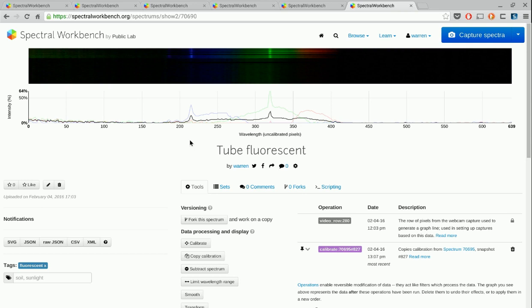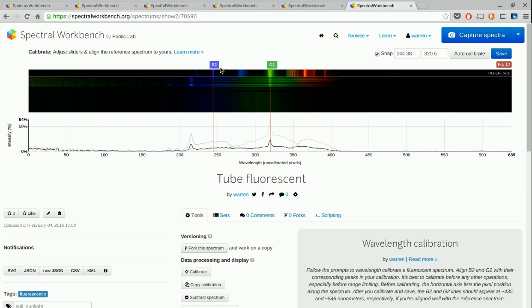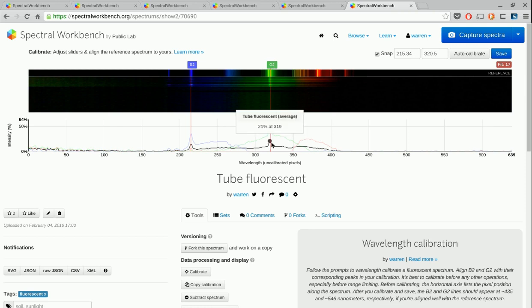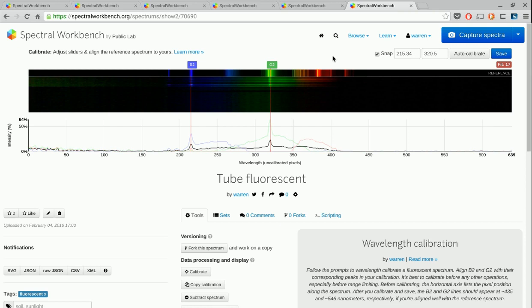And what's interesting about this is I've already done it, but I'll do it one more time to show you. If you press calibrate, it'll still, oh, it didn't actually auto calibrate properly, but if you go here, this will still actually work. That line is actually the one that is showing up on the right hand of these two green peaks. And that would be a reasonably good fit. You will note that it is not showing me that it's super good at saying 17, 18, but just for the sake of argument, if that's the only bulb you have, you can still use it.